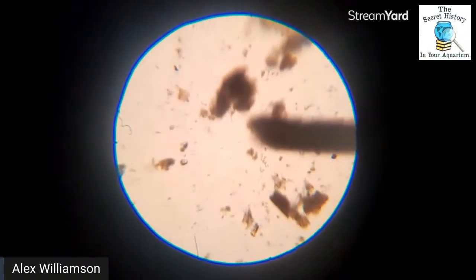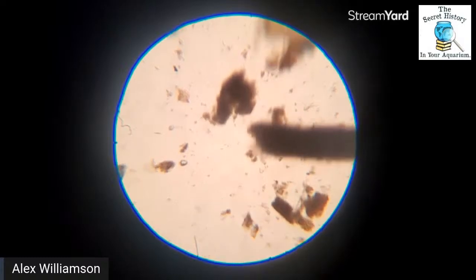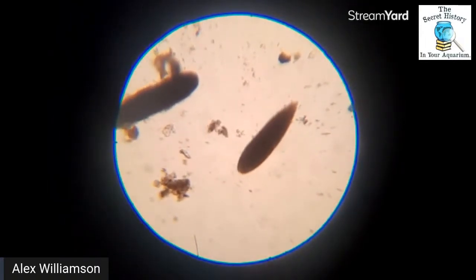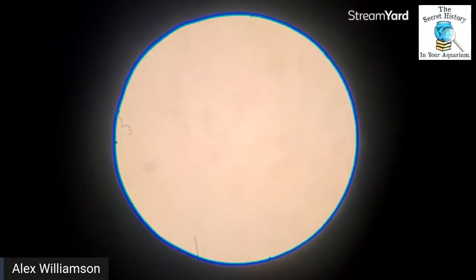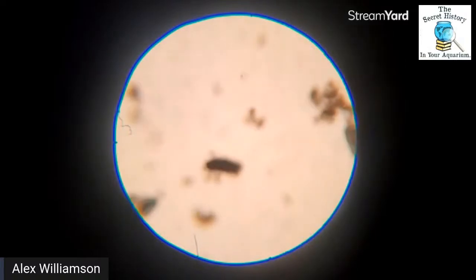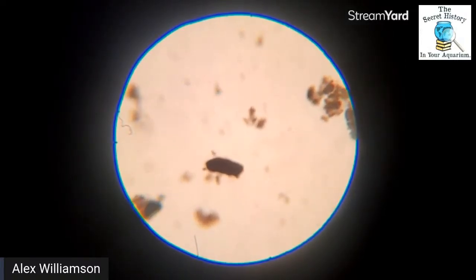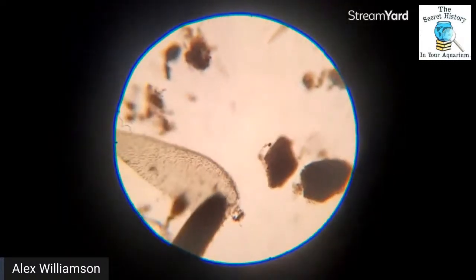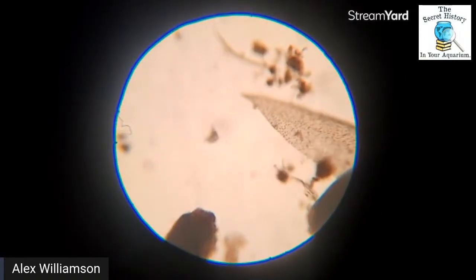When we were down this small, we were seeing little whirligigs and stuff. Where'd they all go? Are they higher up in the water? Lower? Maybe they've all left the building. I think we might need to look at something for the sake of a stream that doesn't bore you all to death. Oh, there's some more life. There it goes, just running away from me, as per usual. Not even microscopic life wants to hang out. You got another stentor? Just chilling, like a little villain, at 100-fold magnification.